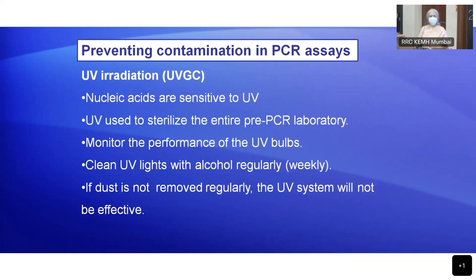Then the other thing that you can have in the lab is UV radiation, and how it works and what it does with the radiation, right? The only thing that I want us to remember as far as UV radiation is concerned is that the UV light has to be clean for it to radiate. That UV 254 nanometer will come only if it is clean.